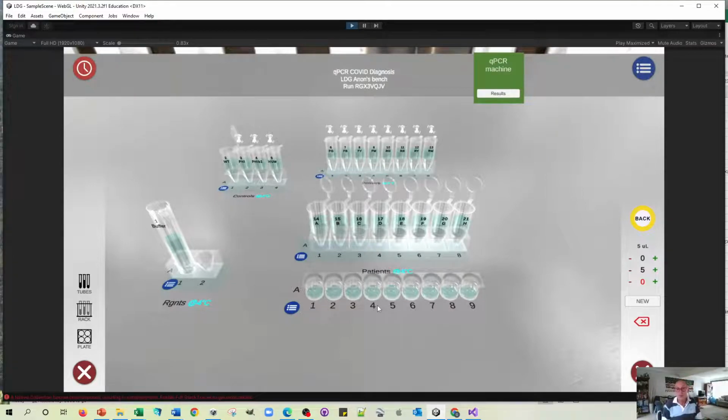It's completely non-plagiarisable. There's lots of reasoning to do, but they also have to get the design piece done properly. They have to get the execution piece done. And it's only really if they've got data that looks robust that they can then go ahead and start trying to piece together which COVID species is in each of these tubes.